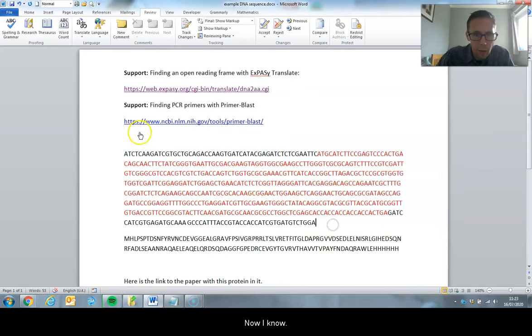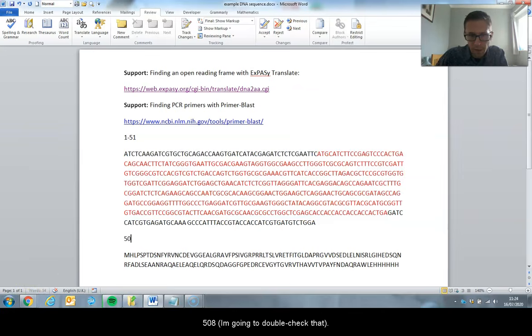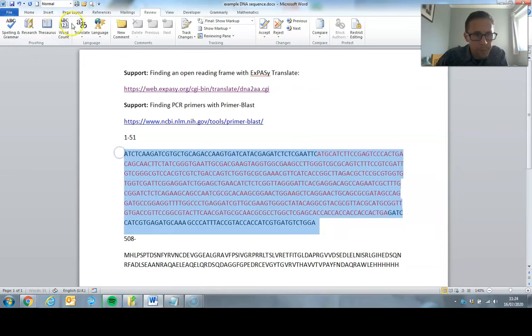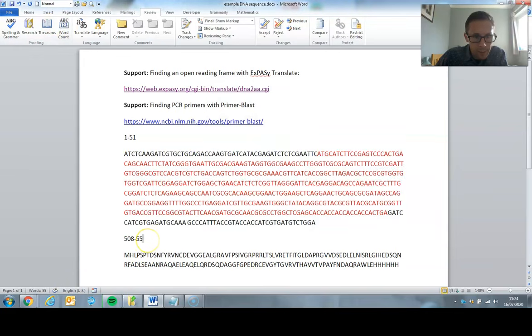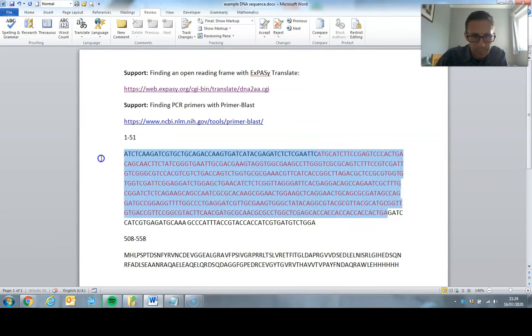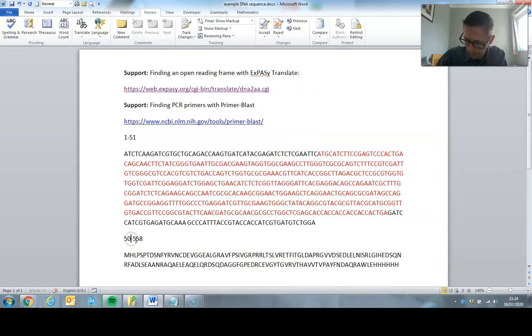So now I know that 1 to 51 contains that sequence, and 508, I'm going to double check that, to the end. Well, I've forgotten already, so let's double check. 558. 554, see, it's always worth checking.